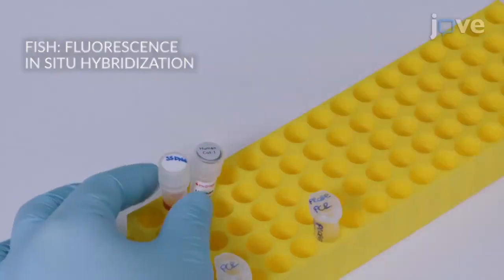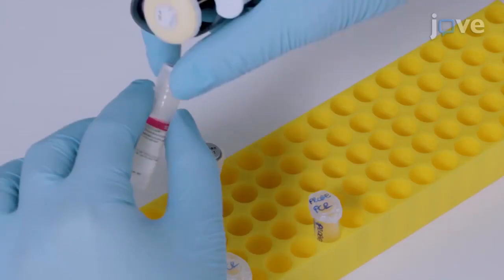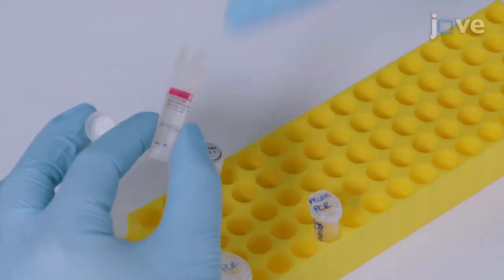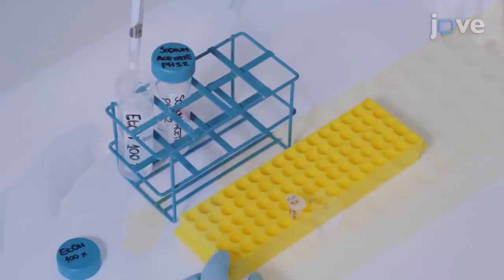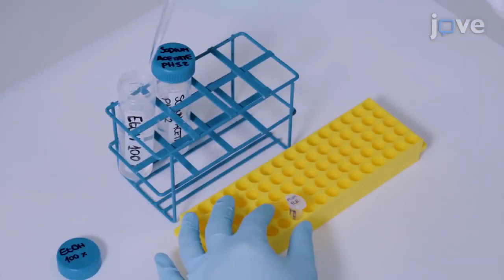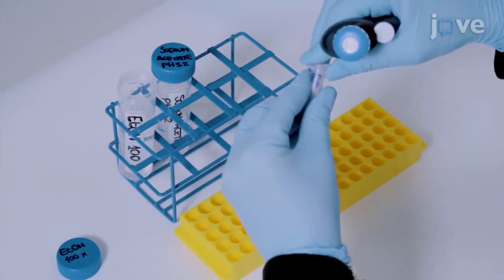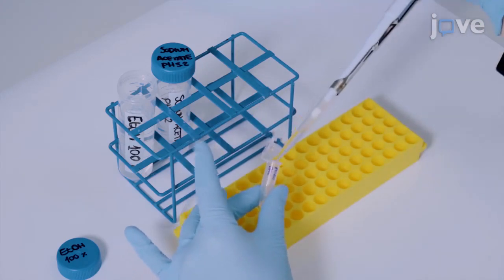3.5 micrograms of species-specific COT1 DNA, 3 volumes of 100% ethanol, and a 1 tenth volume of 3 molar sodium acetate for 1 hour at minus 80 degrees Celsius.